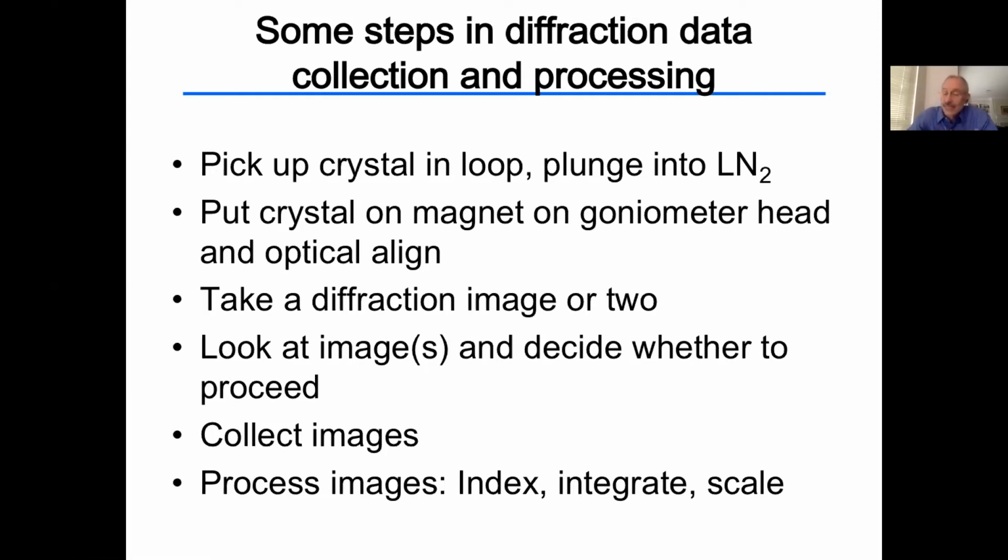A couple of things that are different than years ago. Nowadays at modern beam lines, people try to bring excess crystals, and they will often simply collect the images. They won't do a diffraction image or two. They won't look at the images. They may do different exposure times, different distances, and so on, and hope that they luck out.